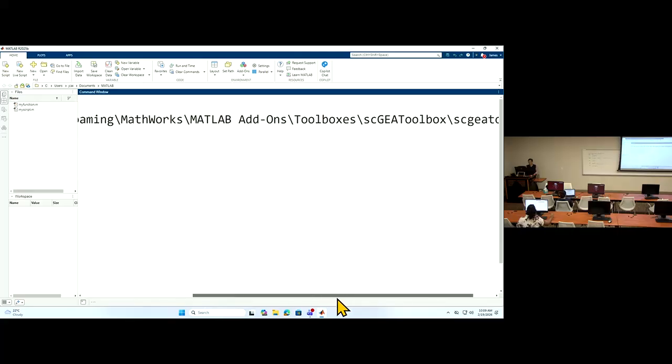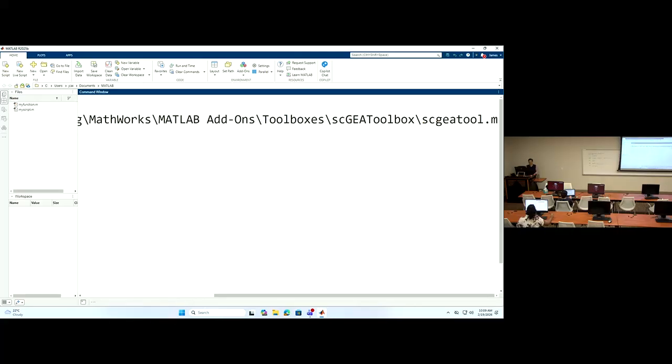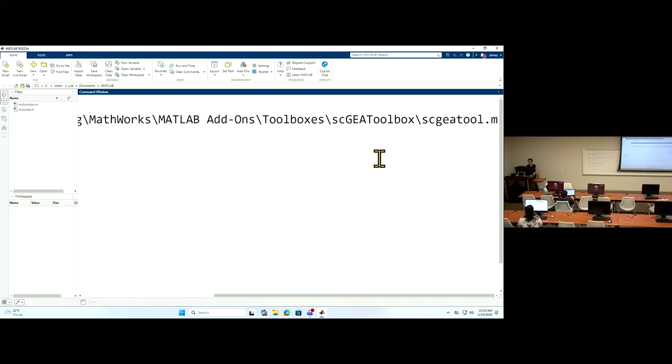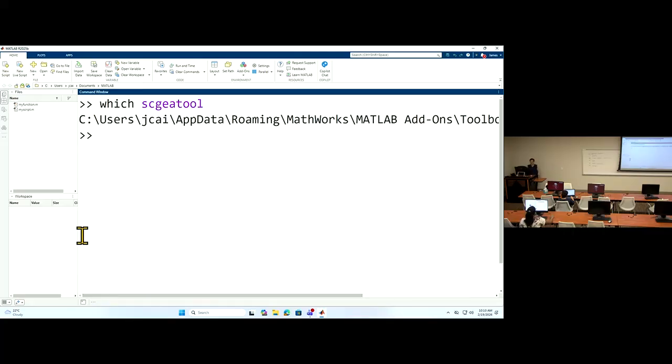Now we are going to uninstall this, and then reinstall it. In that way, you have the latest version online. If you don't do that and directly install a new version, I believe you will have another single-cell gene expression toolbox number 2 after that. You don't want to have 2 different versions coexisting on the same system. So that's why I encourage you to uninstall the older version.